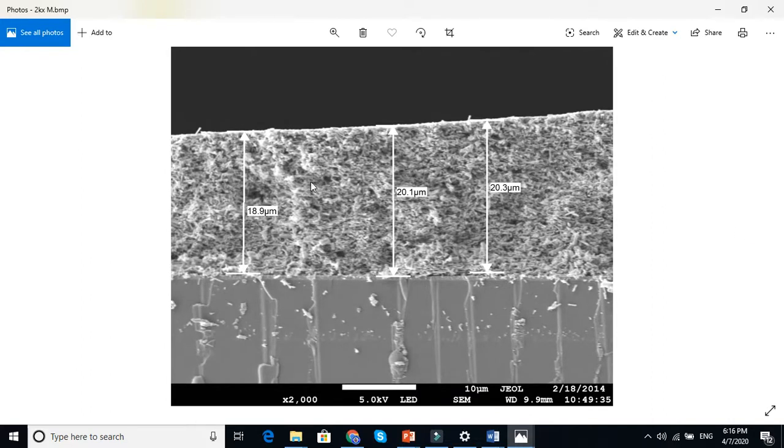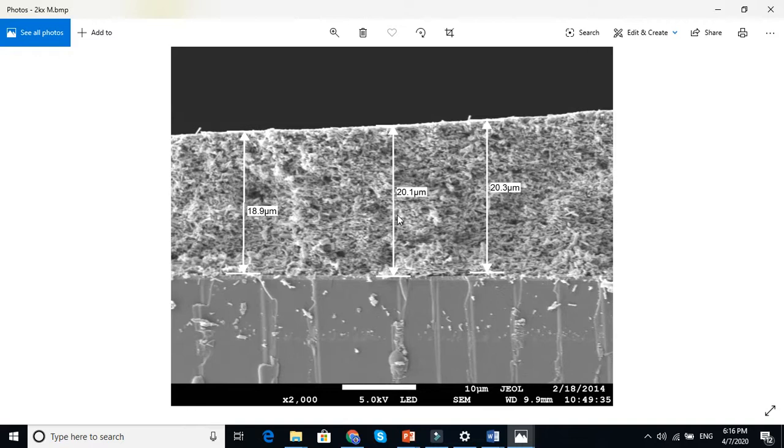Don't see that it looks like big because we increase the scale. But you see, there it was almost 30 micron, and here is 18 micron, or 20 micron. So our thickness is not smooth here. So this information you can get from scanning electron microscope.